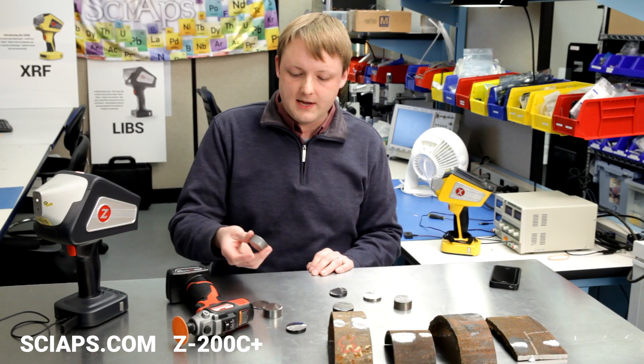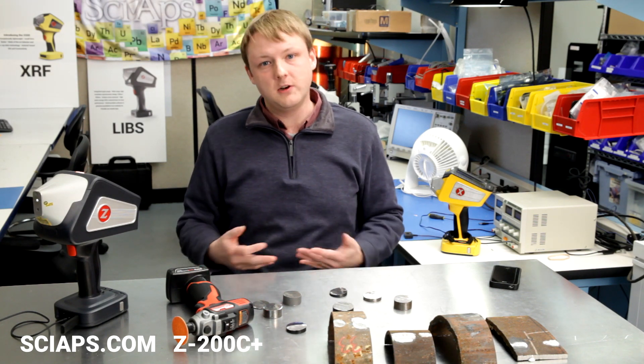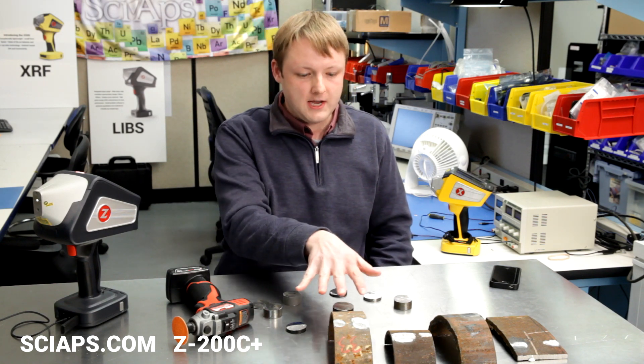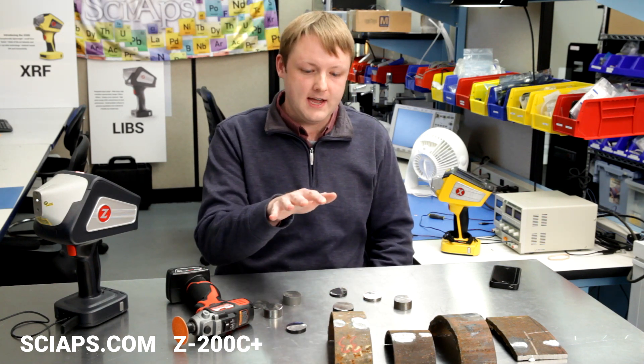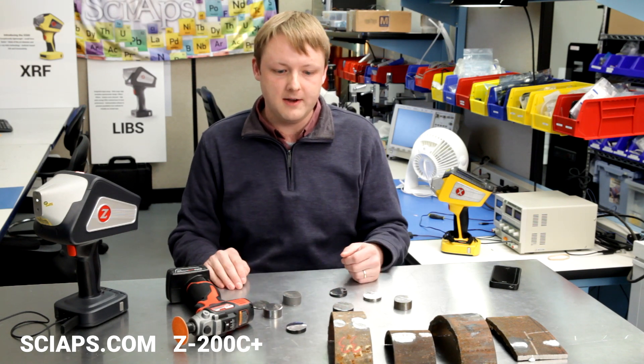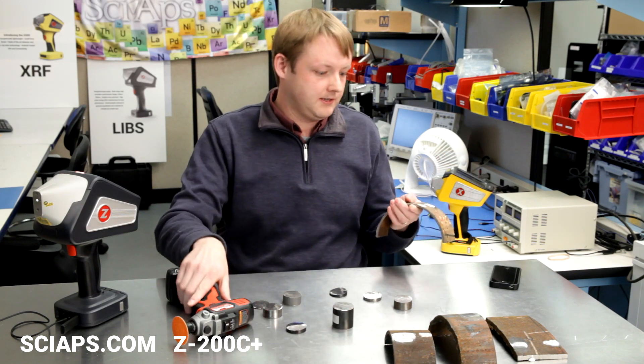All right. Thank you, Don. So the CRM samples — we use those because we know what the carbon content is of them. And for a lot of other user samples, we don't. But these are pipe samples that had carbon content and other elements verified by OES, Spark OES. I'll just do a quick grind and test it for carbon.